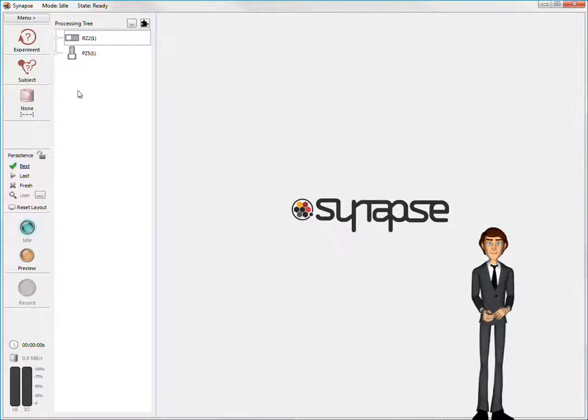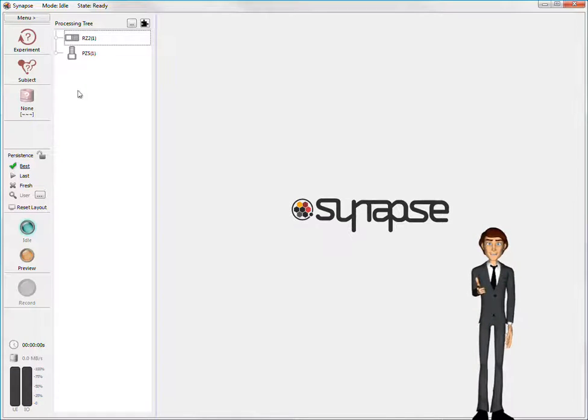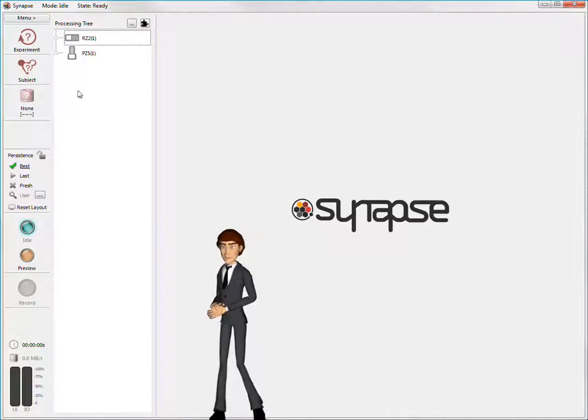Welcome back. In this demo I'm going to show you how you can create a basic experiment with Synapse. I'll show you how to start from a template, and how to begin recording and storing data. To begin, let's take a look at the processing tree.